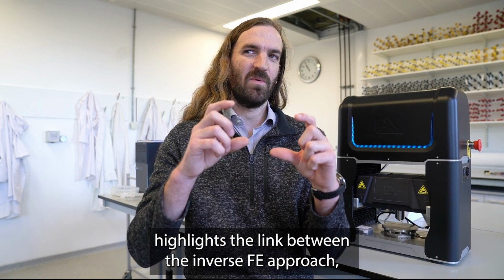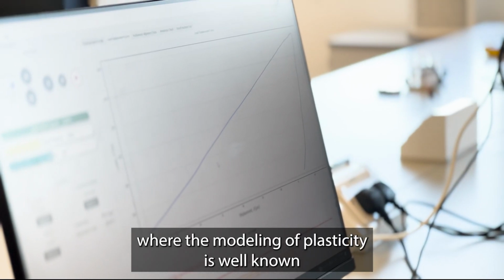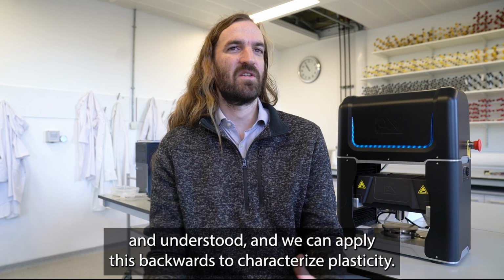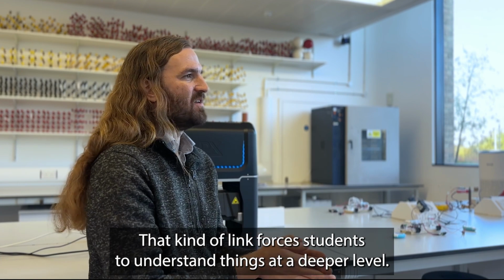So the features of the technique that really attract me to the benchtop machine are that it highlights the link between the inverse FE approach, where the modeling of plasticity is well known and understood, and we can apply this backwards to characterize plasticity. That kind of link forces students to understand things at a deeper level.